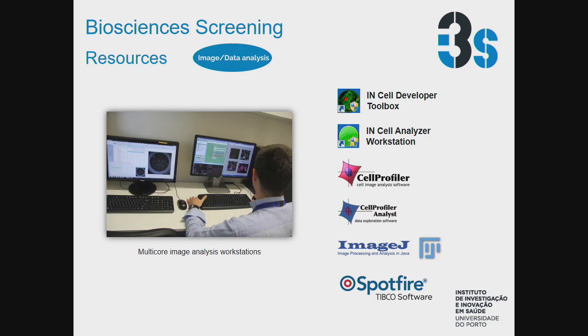For image and data analysis, we have multi-core image analysis workstations that are equipped with image analysis high throughput software. We have licenses of proprietary software that came with the in-cell analyzer, but we also have software and expertise to teach you how to work with open source high throughput image analysis software such as Cell Profiler. You can also use ImageJ. We have machine learning software such as Cell Profiler Analyst, and we also have a software that allows you to do the visual inspection of your data.